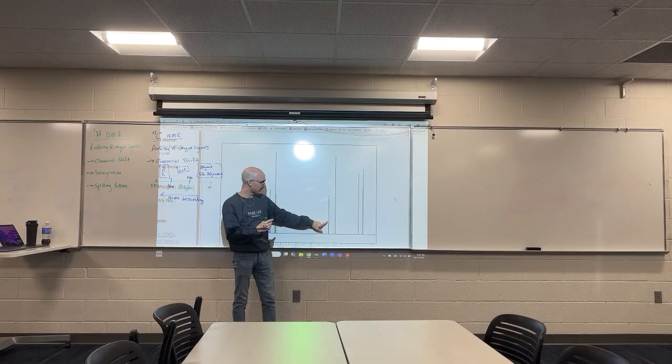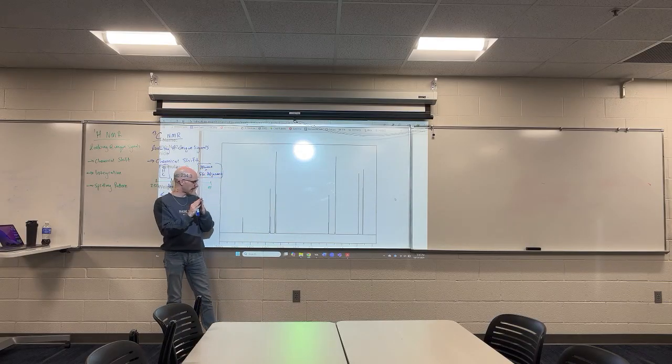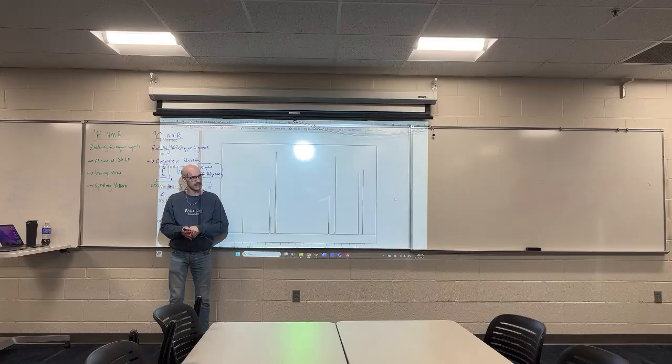This actually looks like the narrowing in as it gets taller. Same thing with this. I think it's just narrowing in, and the same thing here. Because you can see that same narrowing effect, the pixelation at the bottom of these.